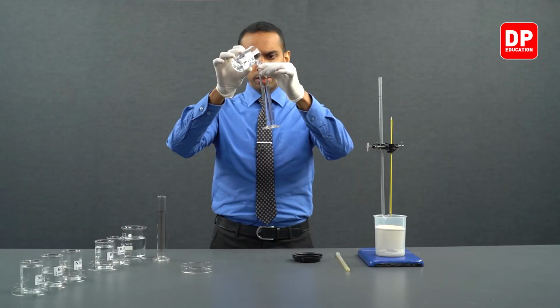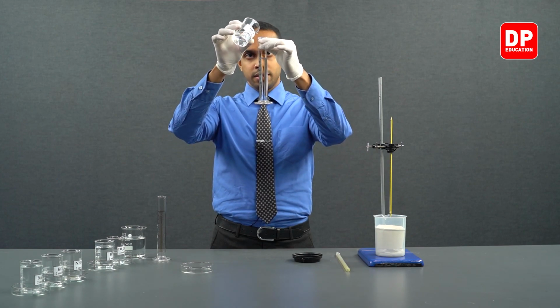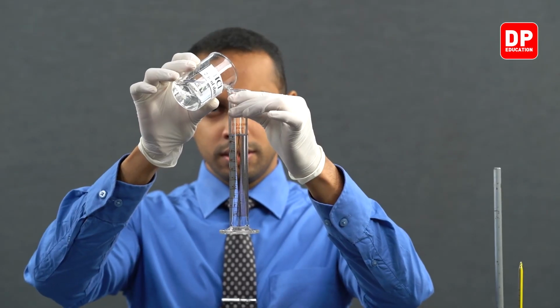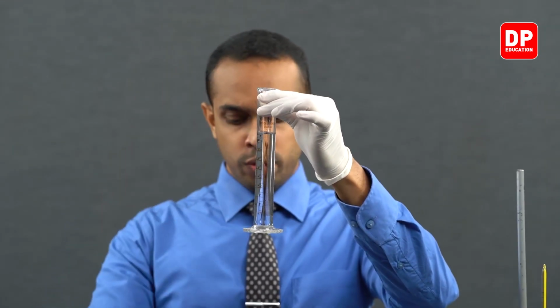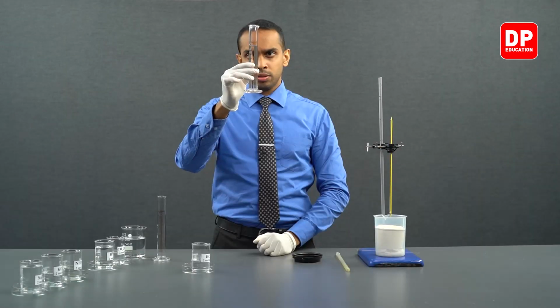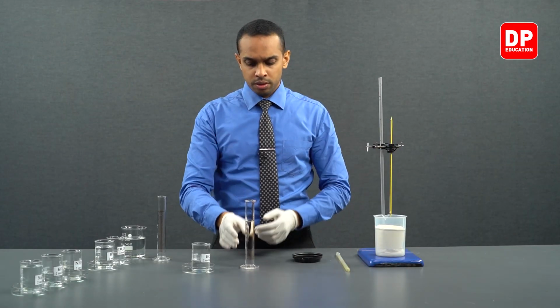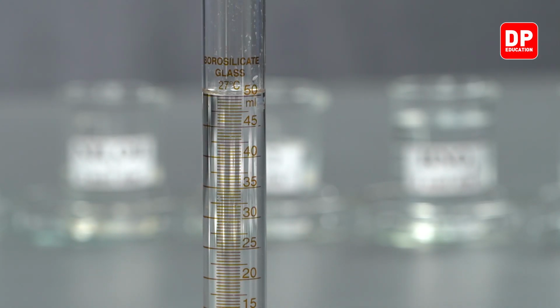As always, when measuring volumes, make sure to take the measuring cylinder to your eye level. Otherwise, you will not be measuring the right amount of solution. So we have measured the right volume here, which is 50 milliliters of HCl.